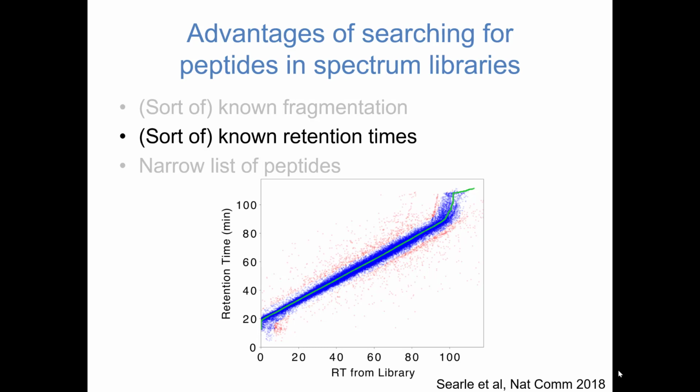I have a question. If you have peptides with PTM and the time drift between the modified and unmodified is more than 5 minutes, can you still match the modified and unmodified the same, in order to calculate the percentage of PTM with modifications? So you think about this plus minus 5 minutes. Some PTMs can drift 6 minutes.